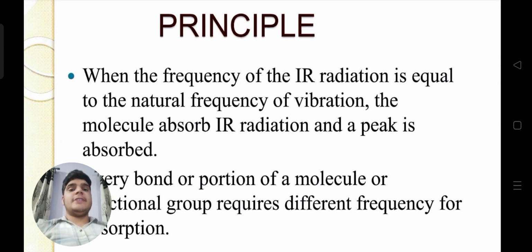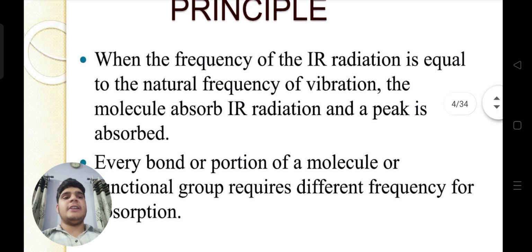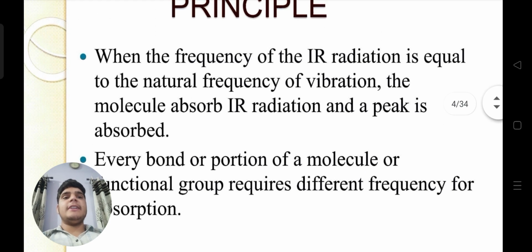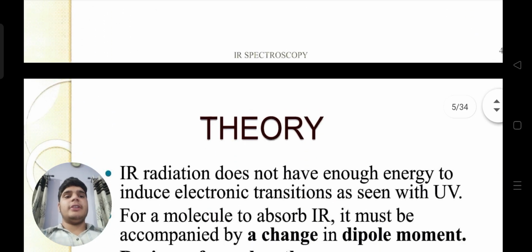When the frequency of IR radiation is equal to the natural frequency of vibration, the molecule absorbs IR radiation and a peak is observed. Every bond or portion of a molecule or functional group requires a different frequency for absorption. Here is the principle of IR spectroscopy. Let's start now with the theory.